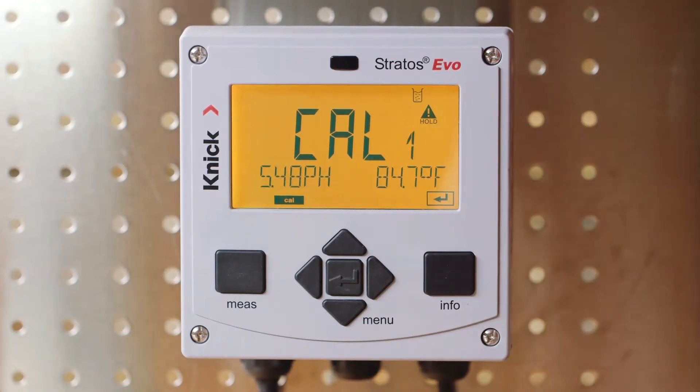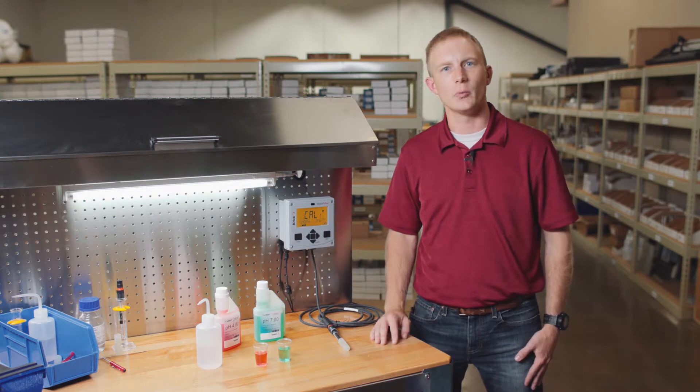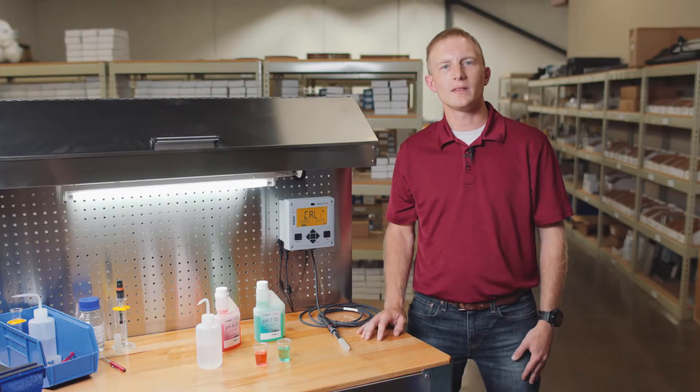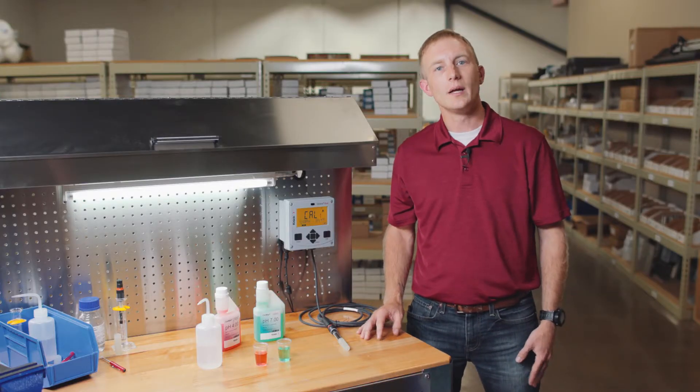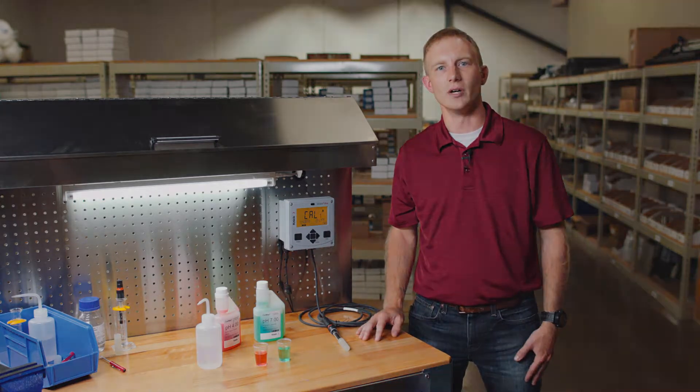Since we're performing an automatic calibration, it's very important that the proper buffer sets are selected when configuring the transmitter. Automatic calibration ensures that the buffer sets are temperature compensated and they're automatically recognized during the process. If you're unfamiliar on where to make the selection of the proper buffer set, please be sure to view our setup and configuration video on the Stratas Evo.